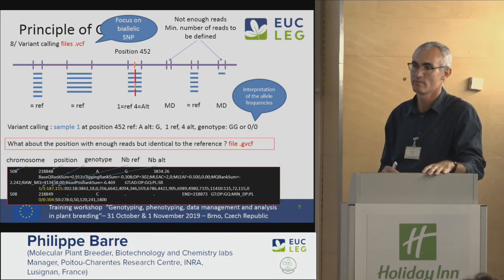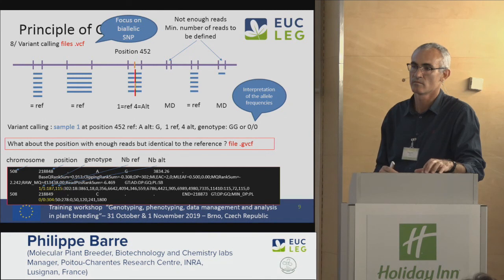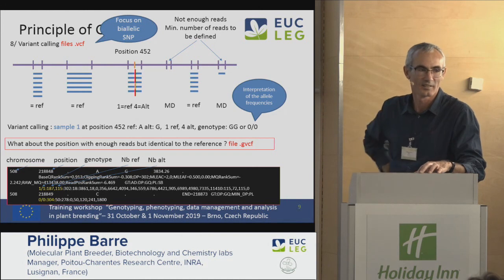Oh, yeah. And can you use a chi-square test to determine whether this is by chance or not by chance? Is this helpful there? These things are incorporated in the software. All of these interpretations are automatically incorporated in the software.